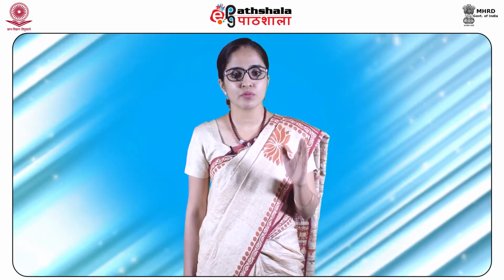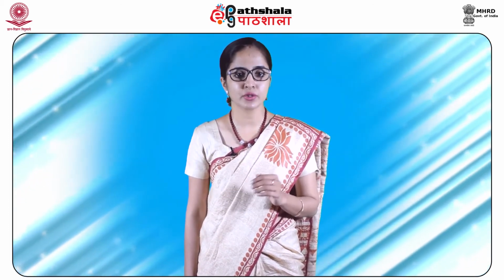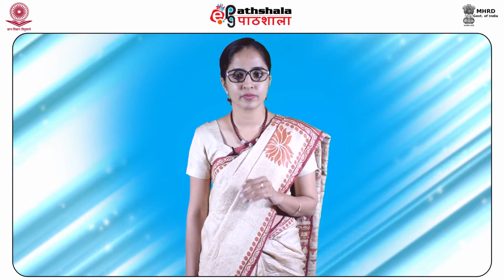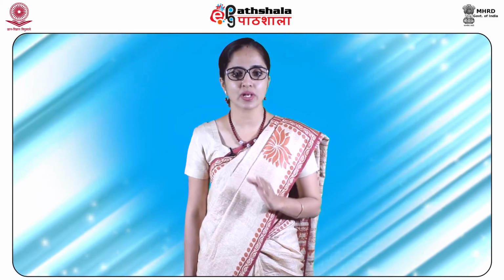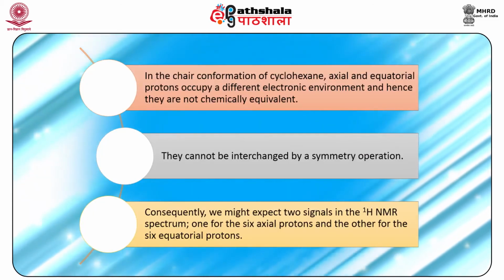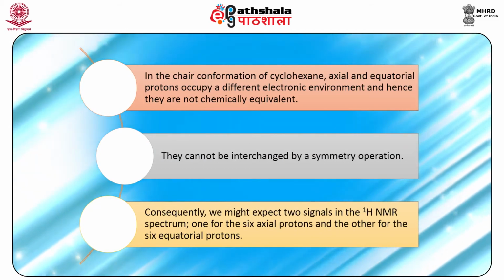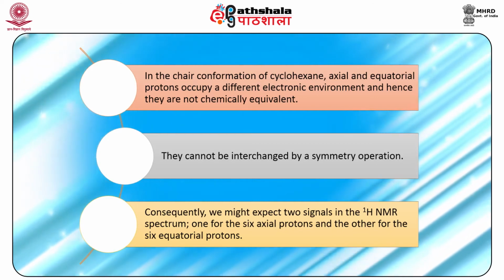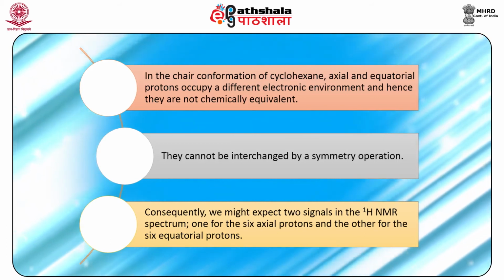If two or more protons are in the same equivalent environment, then they will have the same chemical shift and appear as one signal. In a methyl group, that is a CH3 group, all three protons are always equivalent. In a methylene group, the two protons are also equivalent unless adjacent to a chiral center. In the chair conformation of cyclohexane, axial and equatorial protons occupy a different electronic environment and hence they are not chemically equivalent. They cannot be interchanged by a symmetry operation.